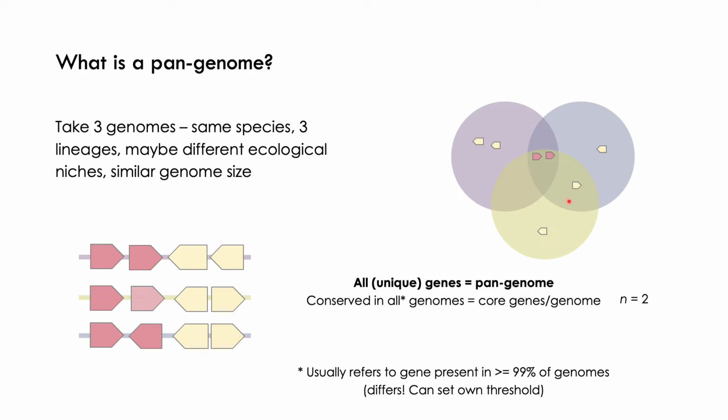And so we've got 2 genes in the core genome there. Then if we remove the redundant accessory protein gene, remember that the purple and the green and blue gene at the 4th position was the same. So again, we only need 1 representative of that one. That leaves only the unique accessory genes left, and we've got 5 of them, so 3 and 2. And then within that accessory set, I've recolored the unique genes now, so you can more clearly see which ones are unique.